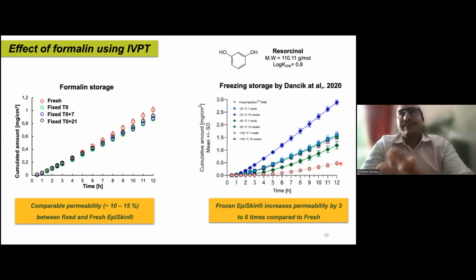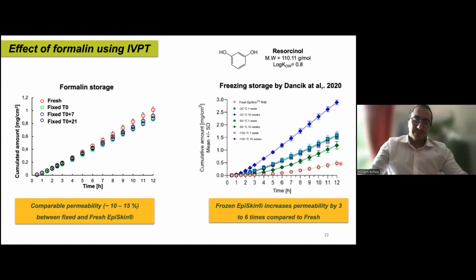While direct comparison between caffeine and resorcinol may present some challenges, it is evident that consistently storing samples below freezing significantly increases skin permeability. In contrast, our findings demonstrate that chemical fixation with formalin leads to a minimal alteration of the barrier function.